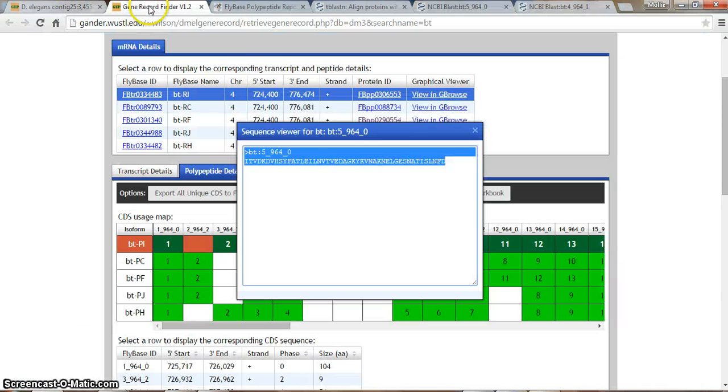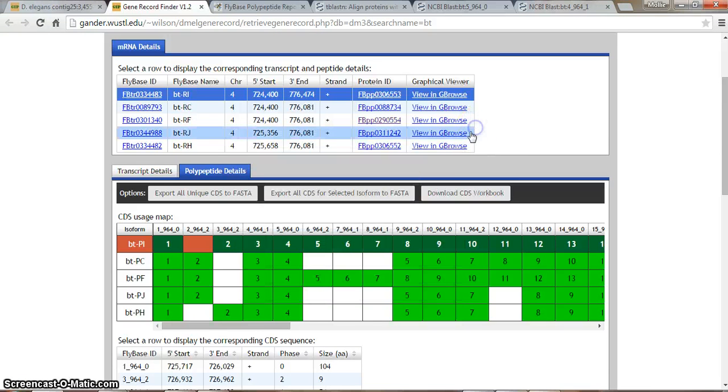Okay, I'm going to go back here and just take a look at my isoforms. So here are my isoforms, and I have done the first 5 exons, but also keep in mind that this first isoform is only between 1 and 2 and 3 and 4. And so I will start with this one.